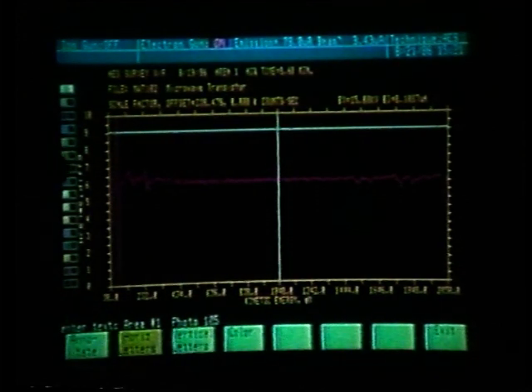On the left side of the graph, we see a color bar. Each color bar is divided into 2 sections. The right section in all of the color bars is black, except for the color bar in which the graphics text will be written. At the top, we see on the left a white bar, and also on the right is a white bar.